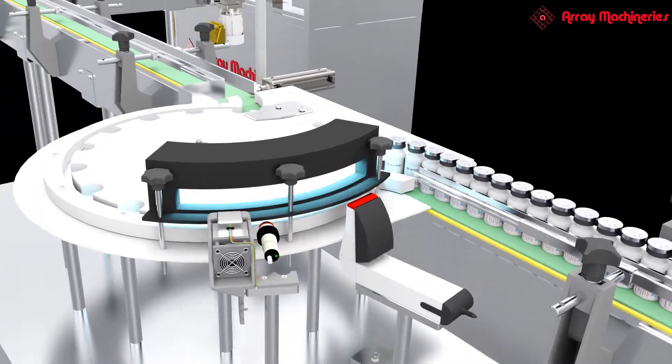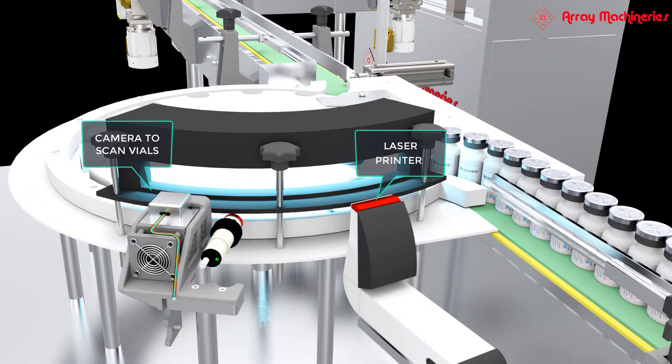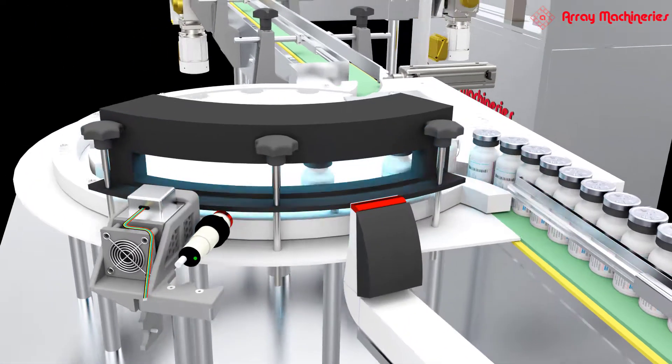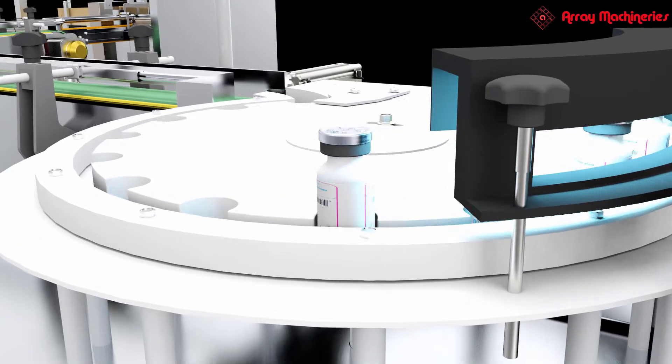Vials are then conveyed to a starwheel, where vials get laser printed and inspected. The laser printer prints while a camera checks the prints on vials.